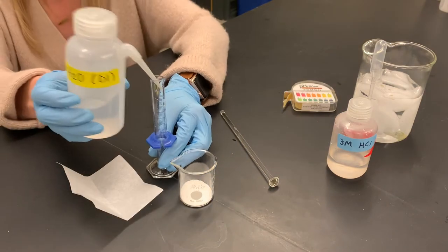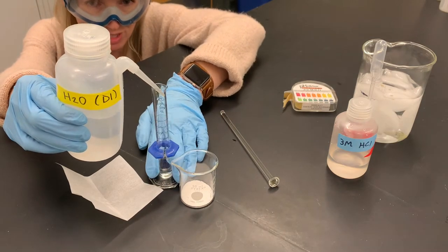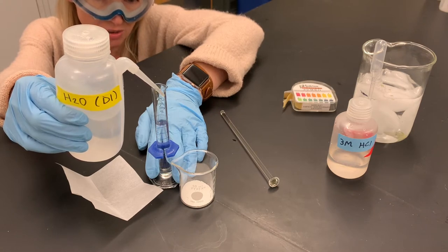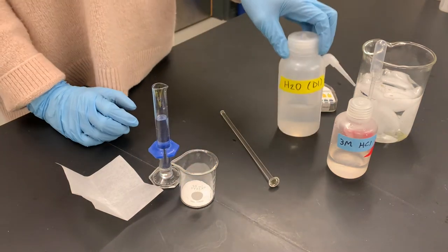I'm going to use a graduated cylinder to measure the deionized water. When measuring with a graduated cylinder, you want to get down to eye level to get an accurate volume measurement, although in this situation it doesn't really matter if our volume of water is exactly 10 milliliters or not.